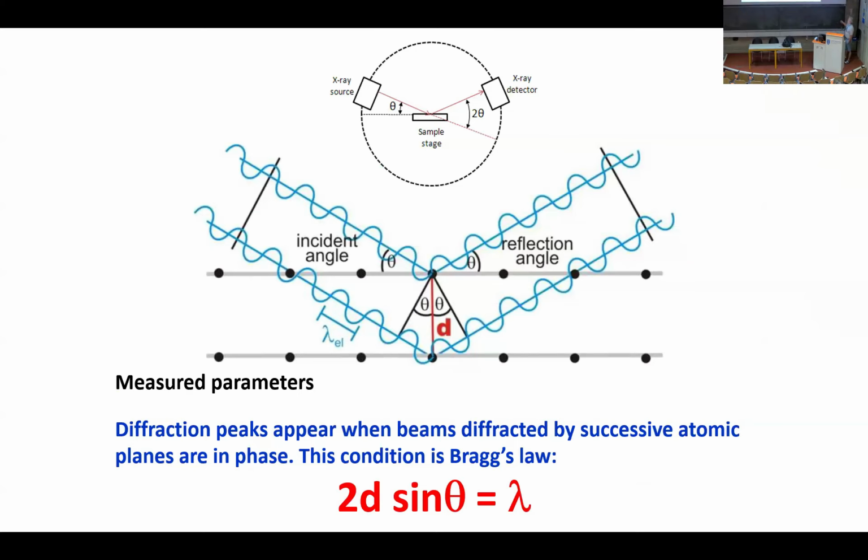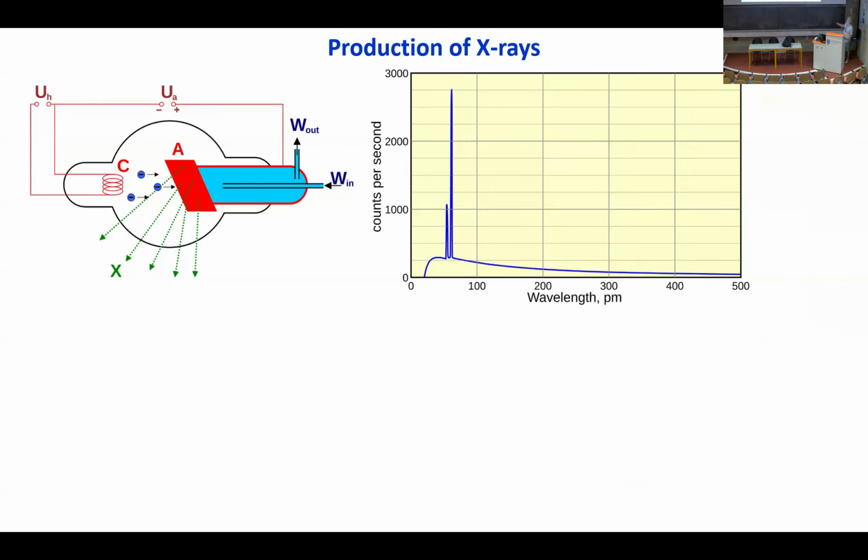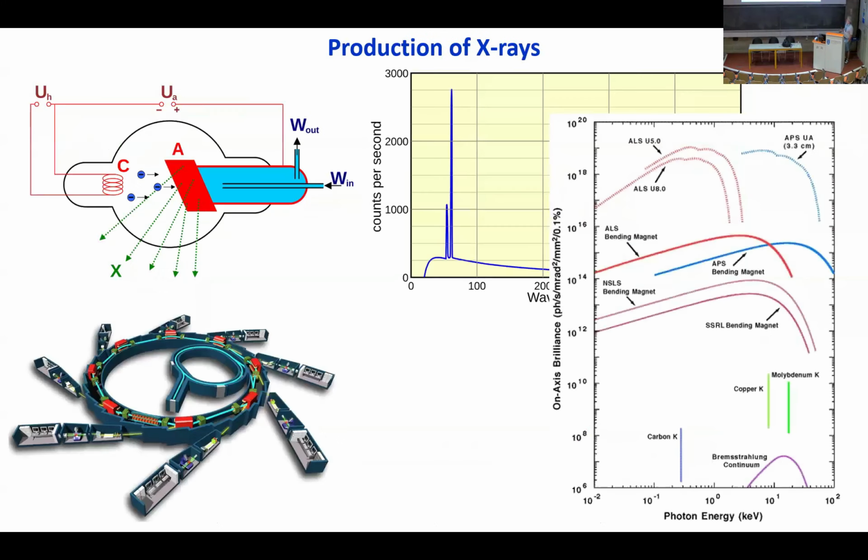If you think about what we showed before, what you want to have from your sample is essentially the wavelengths you've introduced, which means that we want to use one of these 2 wavelengths for the X-ray tubes, or for synchrotron sources, one of the energies or wavelengths you have selected. You will select these by using a monochromator to pick one specific wavelength.